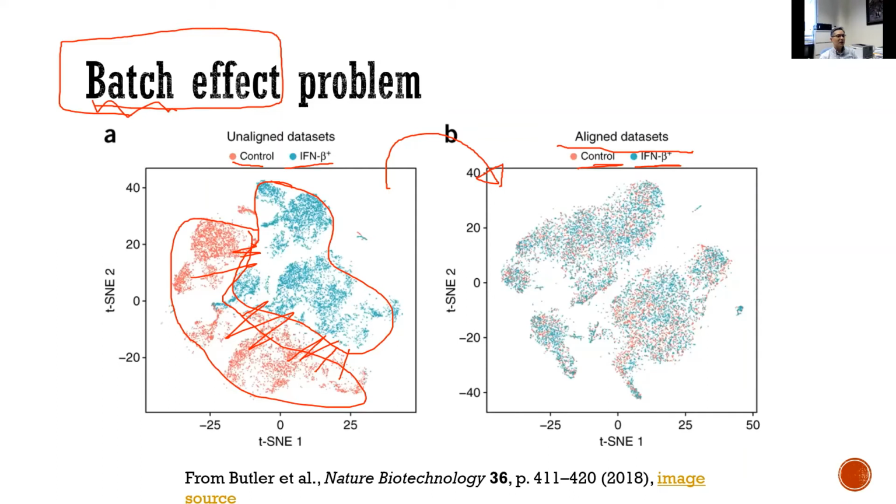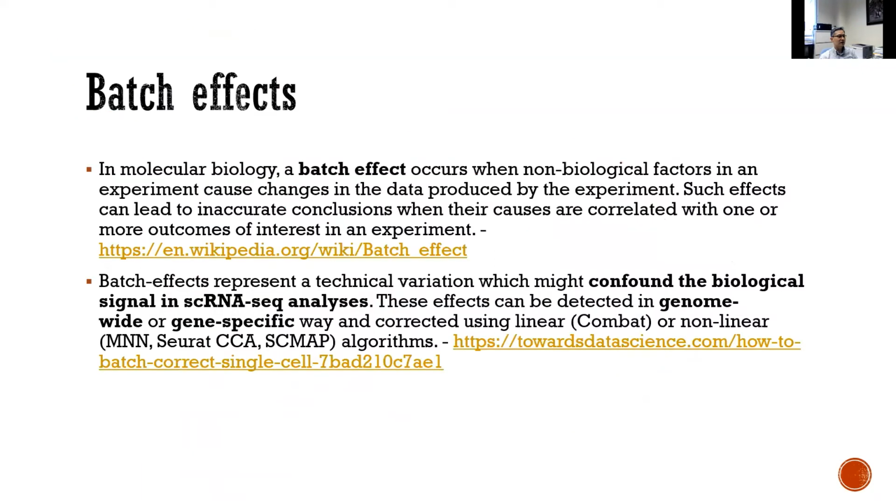So once you achieve this step, you can start to use the batch-effect-corrected data to compare these two conditions and identify genes that really express differently, not globally different.